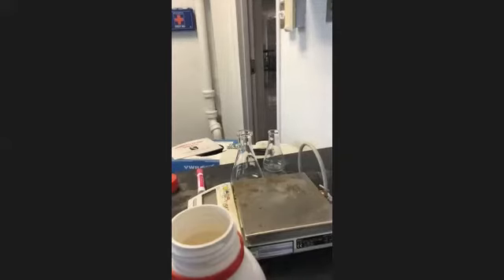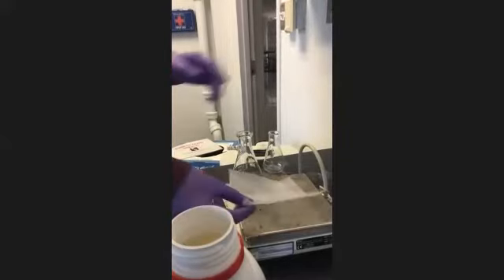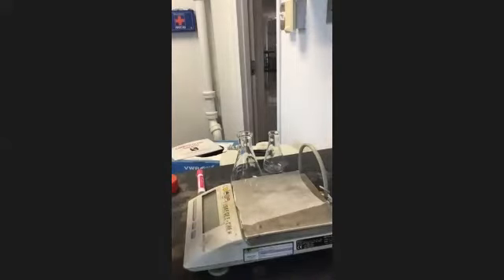So I'm gonna leave that for now. All right. No, it's fine. It's gonna float, so you're good. All right. So we got, you can turn that down too if you want. Put it on about 3. So yeah, let me just weigh out the stuff, and I'm gonna come around with the acetic anhydride. So you can bring your flask though. Yeah. Let me weigh this out right quick.